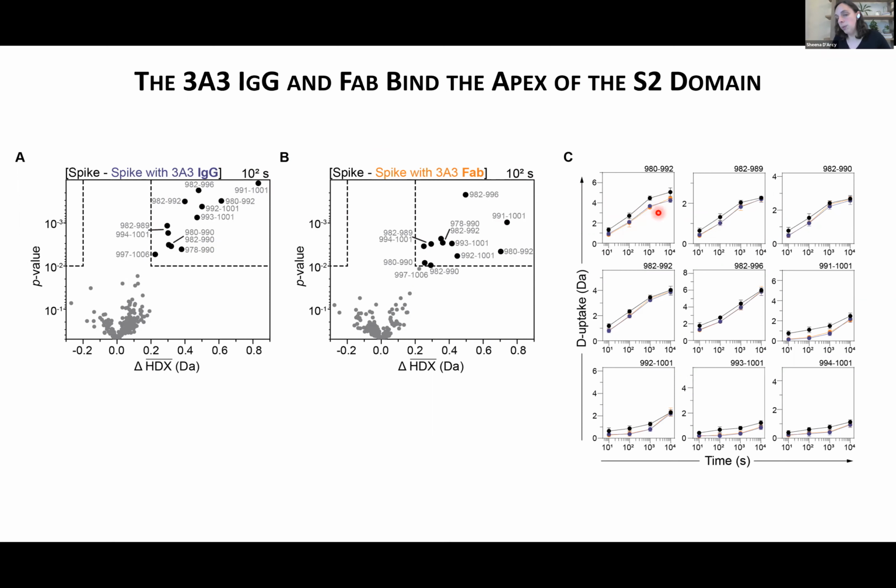Now, what's interesting is if we look at this HDX data in the context of the spike protein in its trimeric form, here again, I'm projecting the HDX data, but in gray, I'm showing regions of the protein for which we had no coverage, right? Remember, that was quite a lot because we didn't allow for glycosylations. We can see that in the trimer, when it's in this closed state, so that's when the receptor binding domains are all in the down state, we cannot have access to our epitope. And as we progressively move these receptor binding domains to their up position, these are different cryo-EM structures that are available. Now we can see our epitope is becoming more available. Before finally in this last structure here, we actually have the ectodomain of the ACE2.